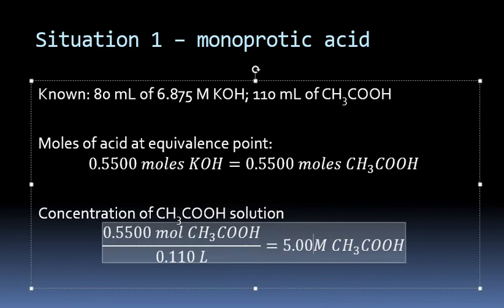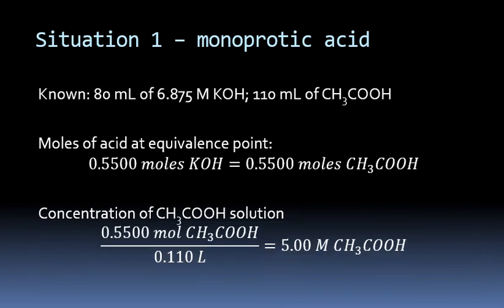So, cool. We can determine that our concentration of acetic acid was actually 5 molar.